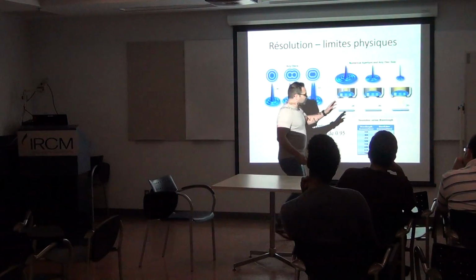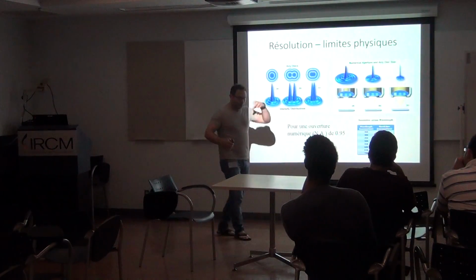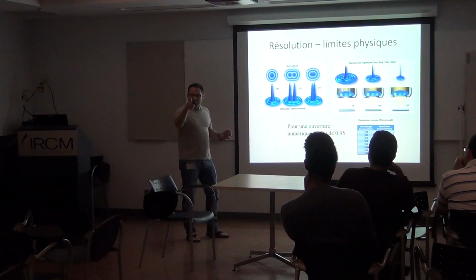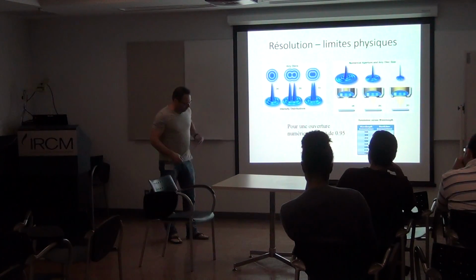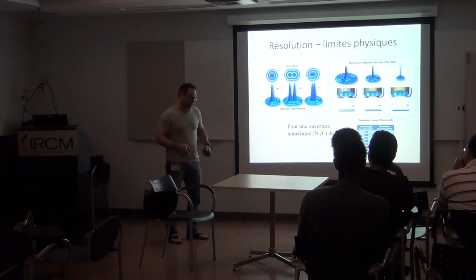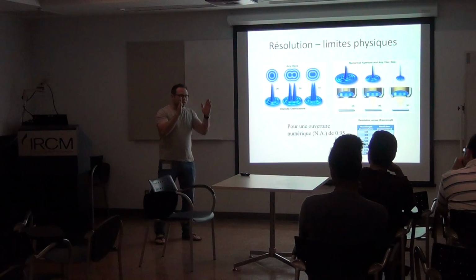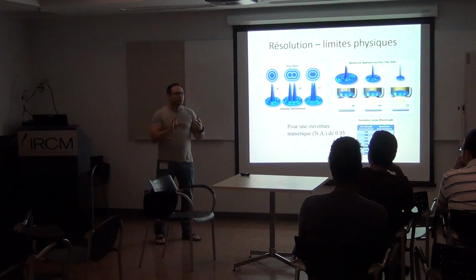And the thing is that a lens in microscopy is different from a lens of a camera like this. Those cameras, or even this device, are mainly lenses where you play with the distance between each lens.